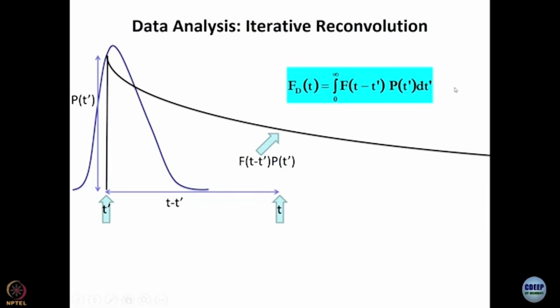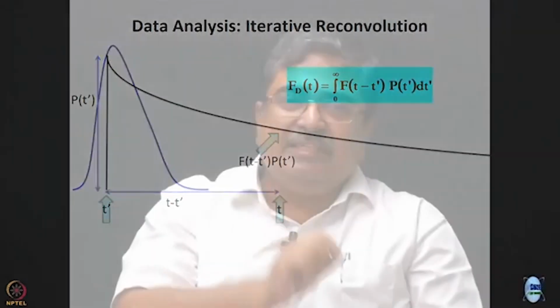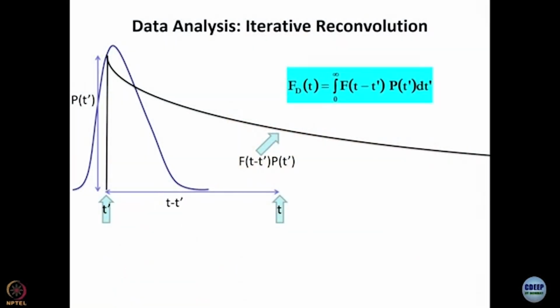So, that gives us the intensity that we actually see at one particular point of time. Important to remember that, at one particular point of time, right. I have not written this for the entire decay, only at the value of t where the arrow presently is. To get the intensity at this value, you have to work out this integral, right. This is the meaning of convolution. But do not get scared by the integral sign, an integral is just a summation.